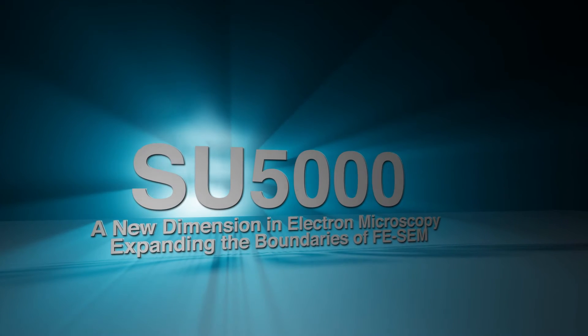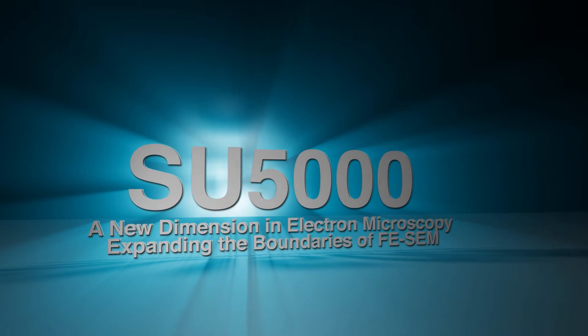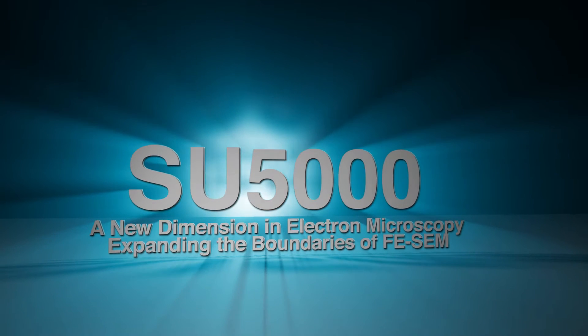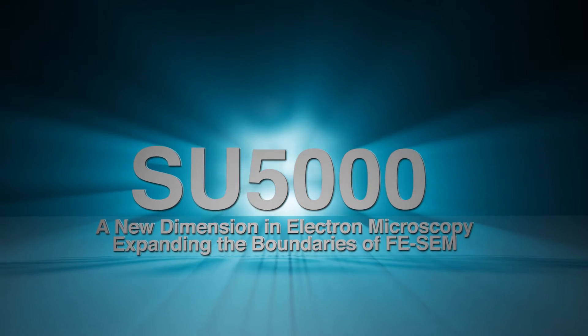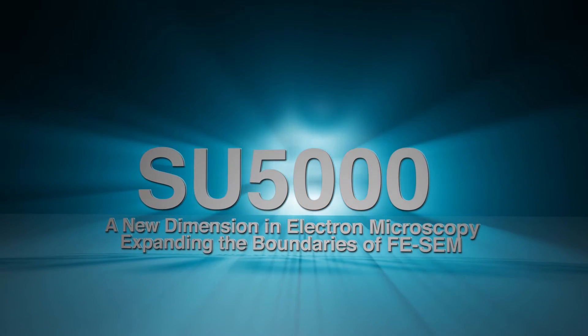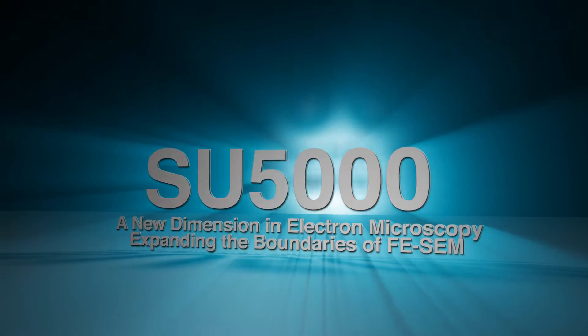SU-5000, a new dimension in electron microscopy, expanding the boundaries of FeSem.